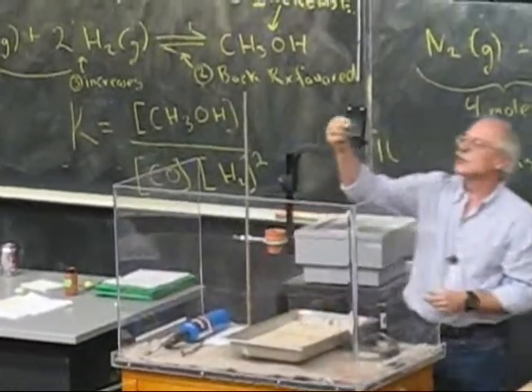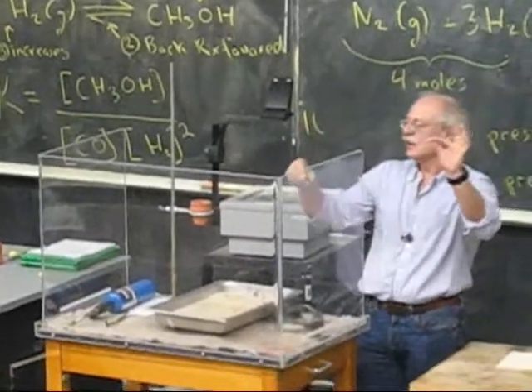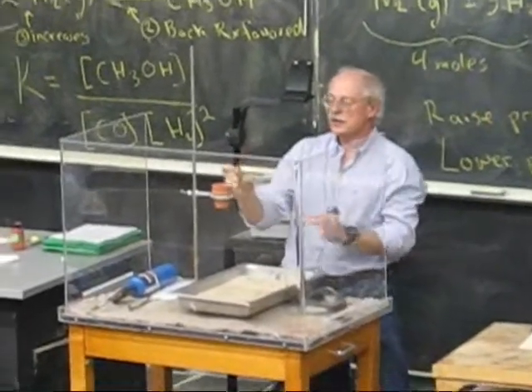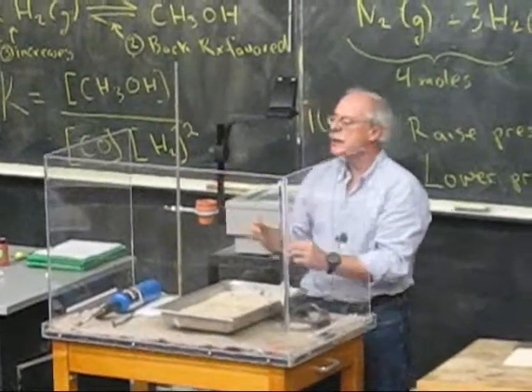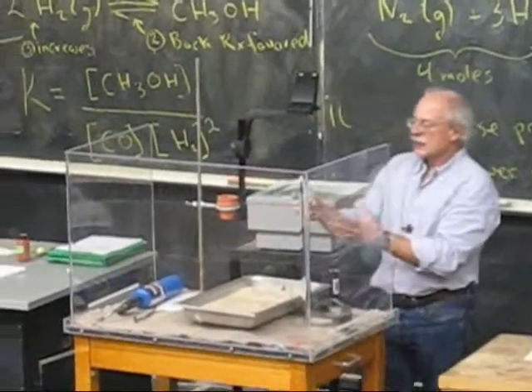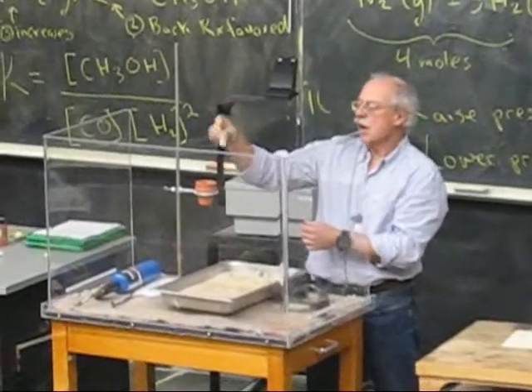And then here, this is a little strip of magnesium. This is magnesium metal. And the reason it's here is because it does have an energy of activation. That's why it didn't explode when I shook it. And in order to get this to go, you have to light something very hot. And magnesium burns hot.